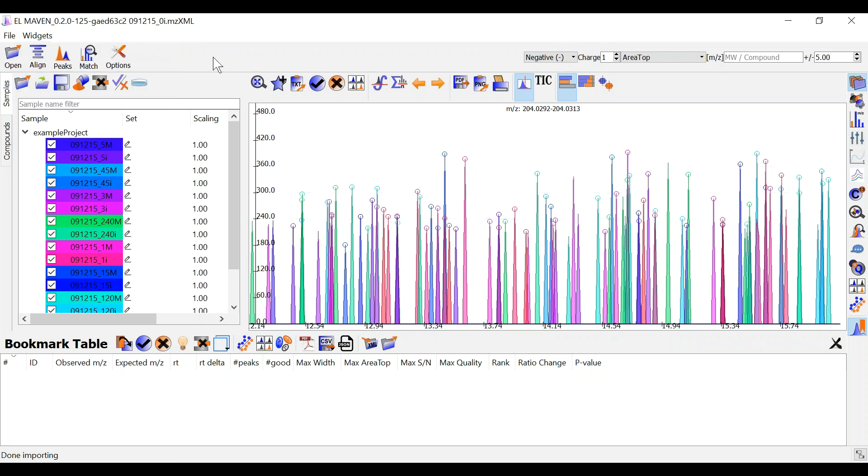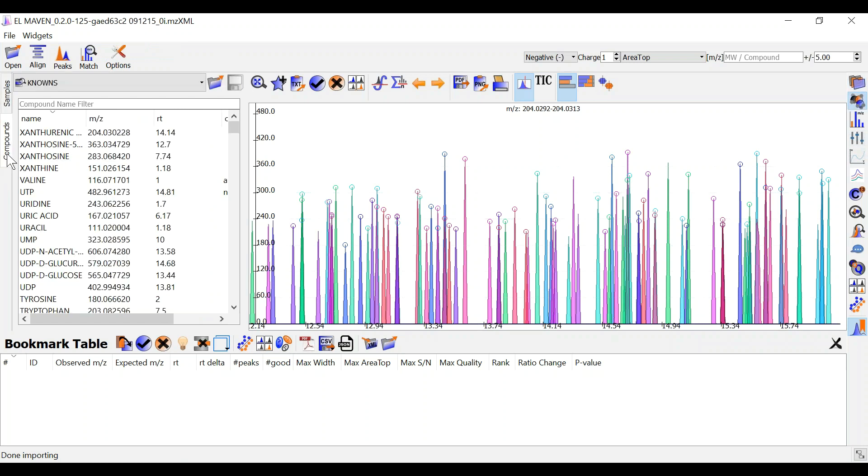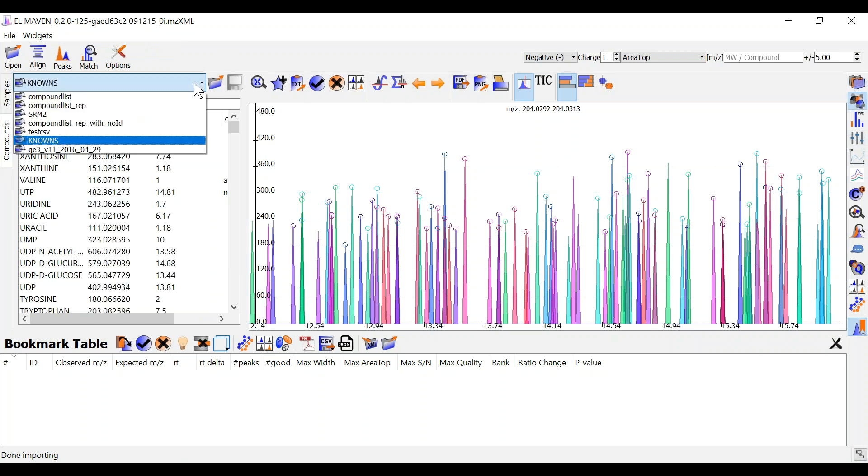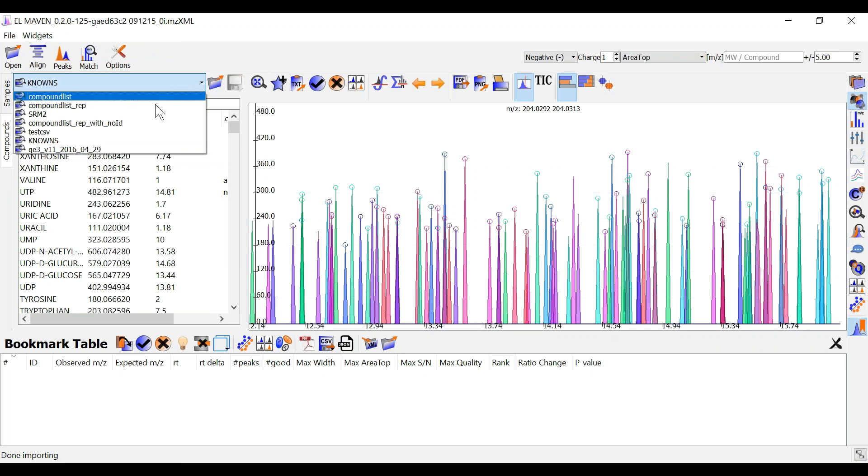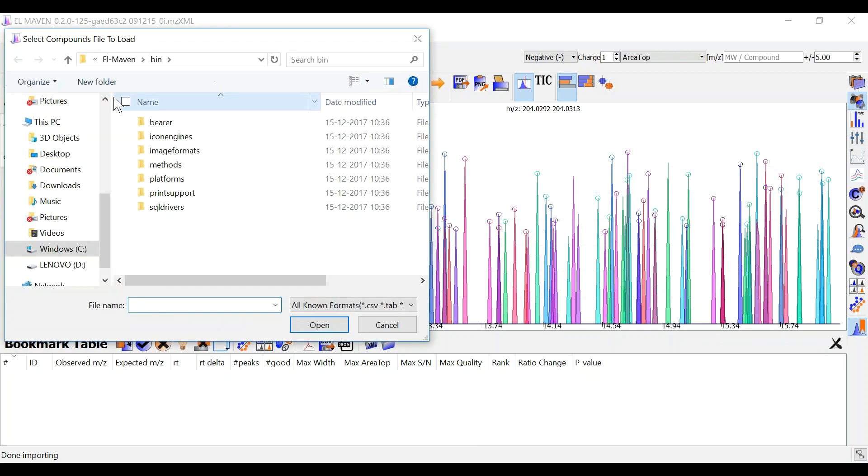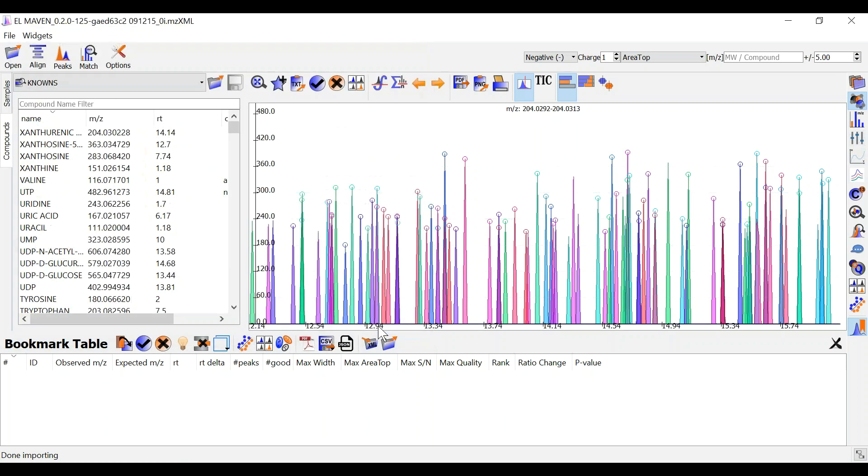Once you are done you should load a compound database. Some preloaded compound databases are present which you can also use. Otherwise you can upload one by selecting .csv file or tab file.